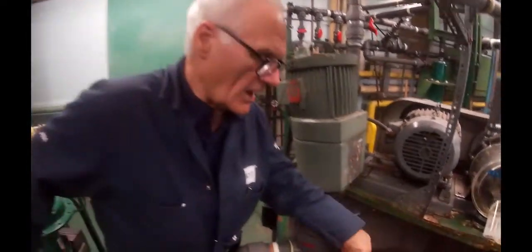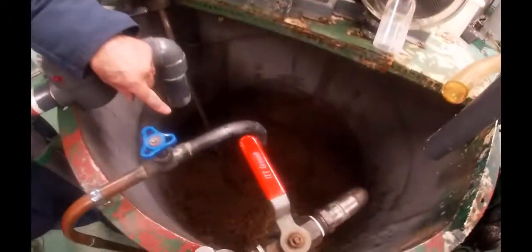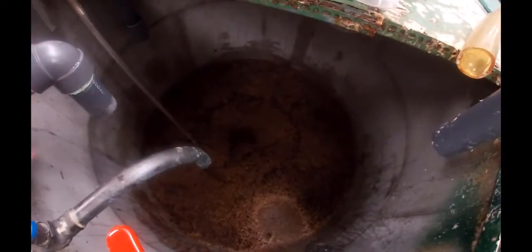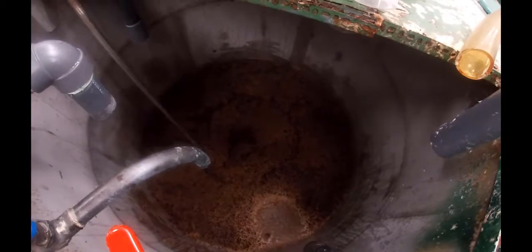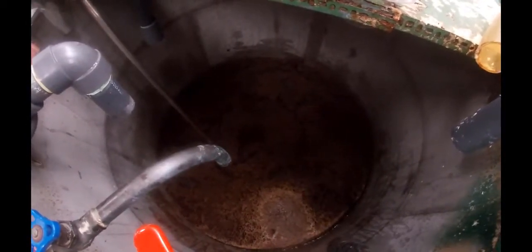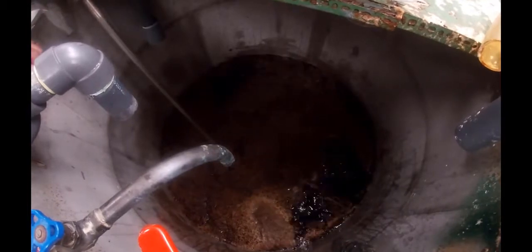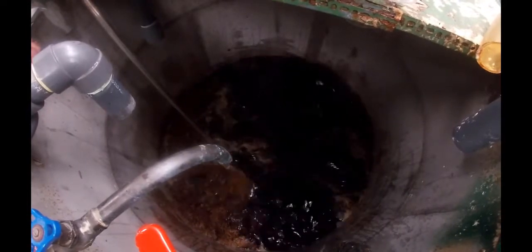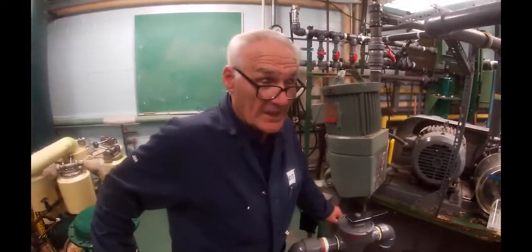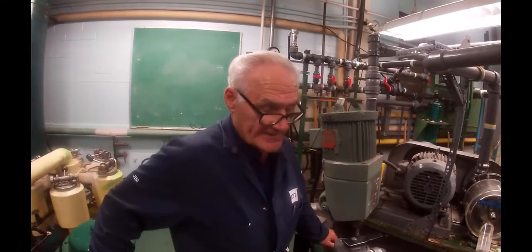So here's the stock that came out of the blow tank and into number 3 stock tank, and it kind of floats to the surface, and so you can see just a pad there. I'm actually going to turn the agitator on, and you'll see that pad start to move and then break up, and then everything has gone into suspension. I want to mix it for just a moment before I take my consistency samples, and then I'll take the consistencies or take a sample out.